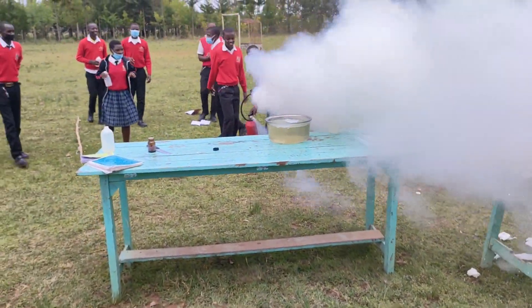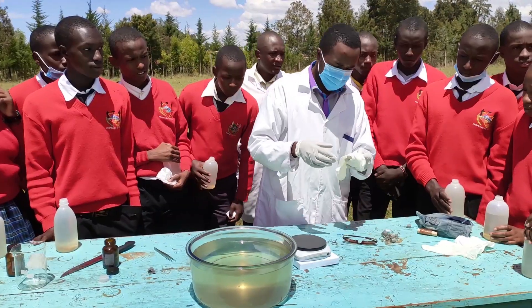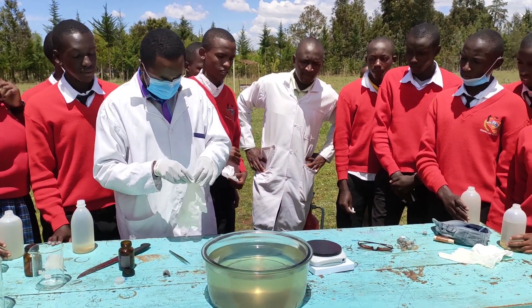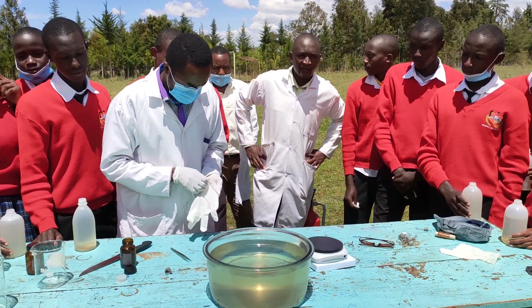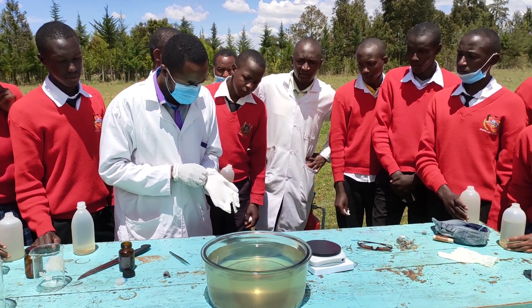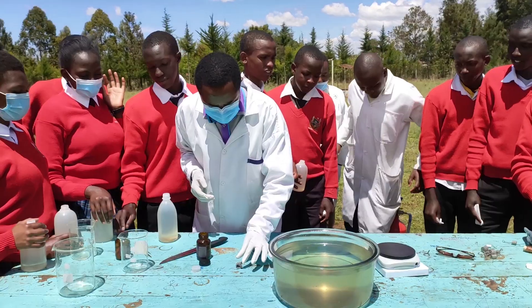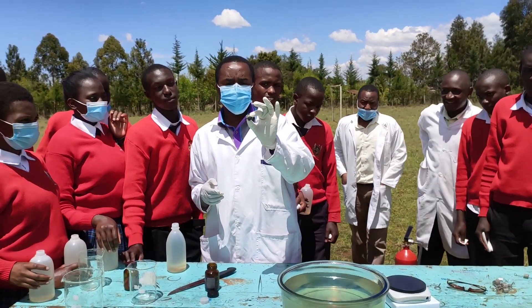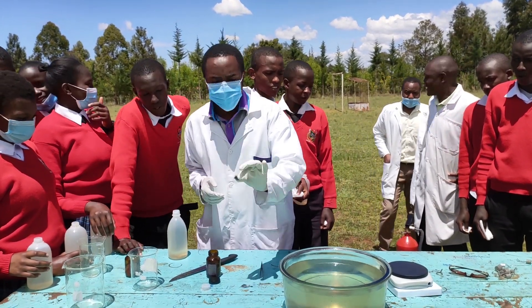And finally, on to potassium. I was so cautious when holding potassium to the extent that I used two gloves. Of course, never ever hold potassium using bare hands — the moisture on your hands would react with it, burning you so badly. We started with a small piece of potassium, about 0.5 grams, floating on water, which would produce a young one of an explosion.